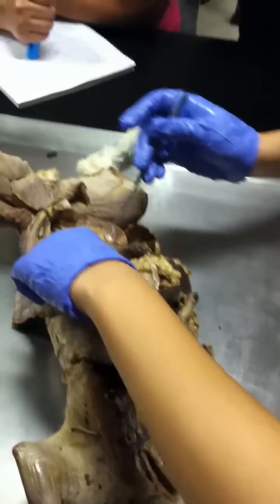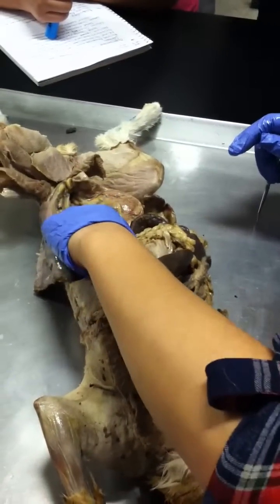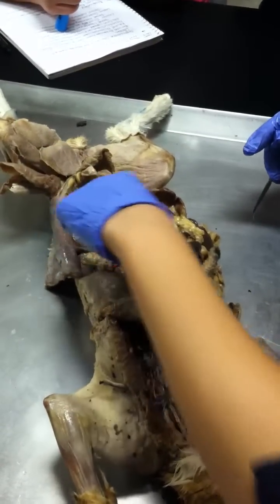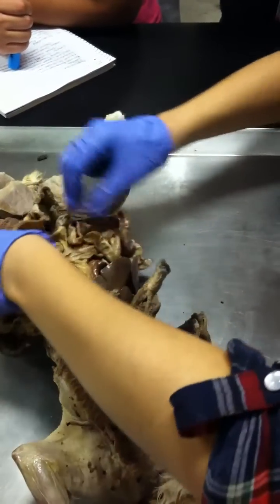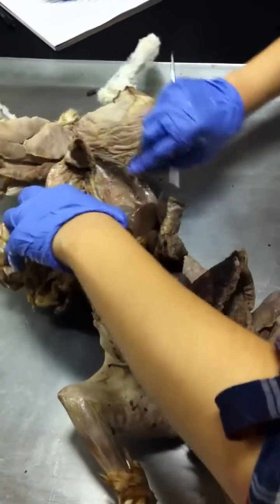Do you guys remember? Some of you guys, I showed you guys the tug trick. Right? By tugging it, you know exactly which gut responds to which system, foregut, midgut, or hindgut. Okay. It's kind of cool. All right. Moving on. I should talk about, since we're down here anyway.